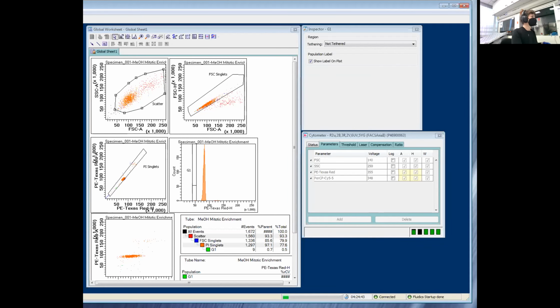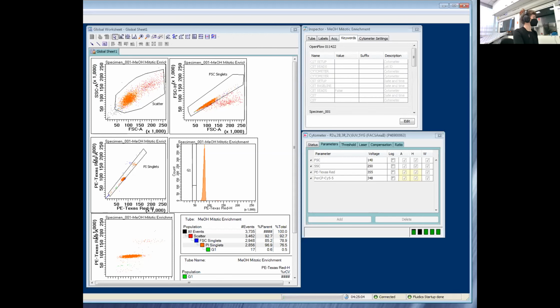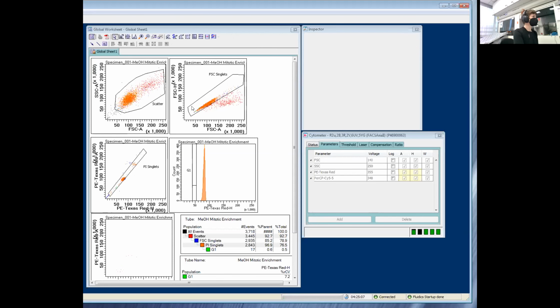All right, so this is just what we'd expect. Now I'm going to cut the recording short so that we have time to do the analysis, right? But I have previously recorded these samples a little bit earlier today. So at the time of analysis, we will have 10,000 to work from. Okay, I'm going to go ahead and stop this recording, acquisition.